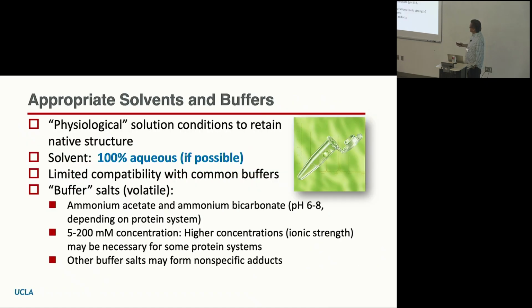But some general comments then for native mass spectrometry. For most complexes you're going to want to study, you want to stay near physiological pH. So pH 7, 6.8, 7.2, something like that. Most proteins stay folded under completely aqueous solutions, so you're not going to be putting acetonitrile, isopropanol, or methanol into your solutions, even though people think it enhances ionization properties, but that's going to unfold your protein. So if your goal is to understand protein interactions with another molecule, you're going to want to stay away from those organic solvents as much as possible.